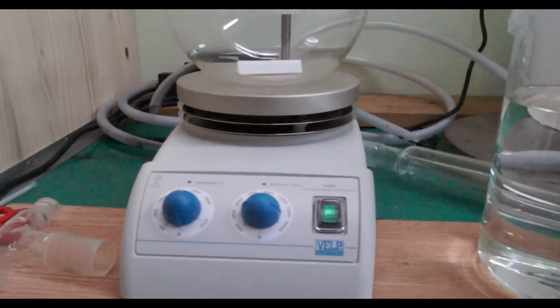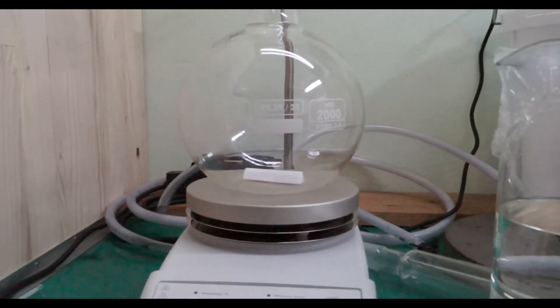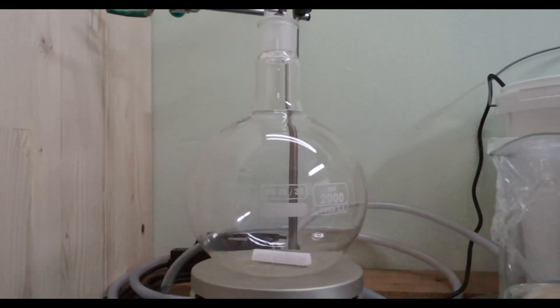I started by charging a 2.0 liter flask equipped with a magnetic stirrer with approximately 1000 milliliters of hydrochloric acid.